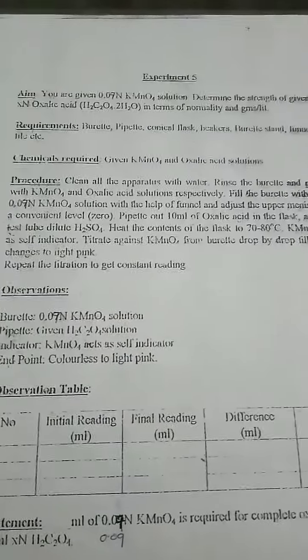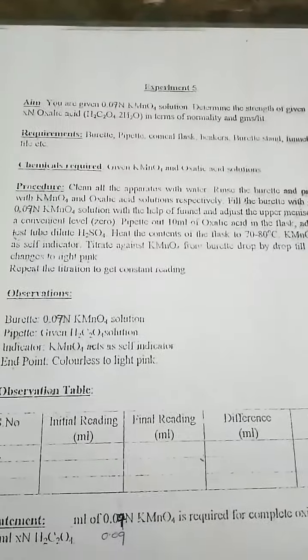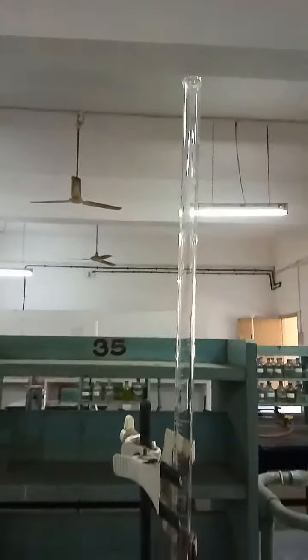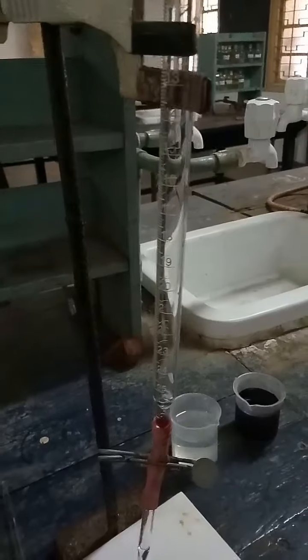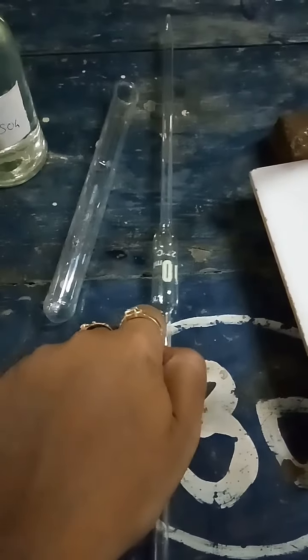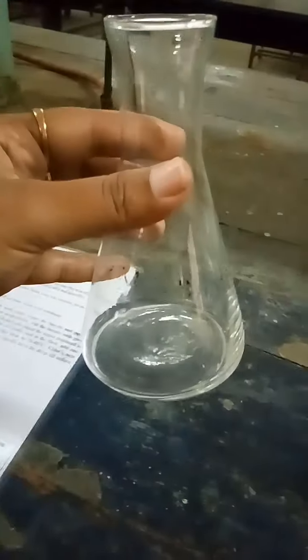The requirements which you need for this experiment are: burette — here you have a 25 ml burette — pipette, and it is a 10 ml pipette, funnel, conical flask, and beakers.